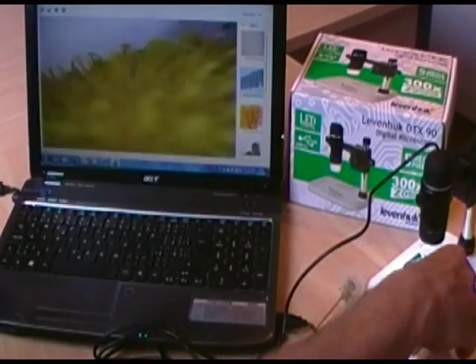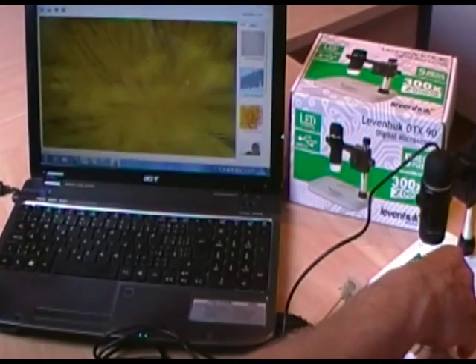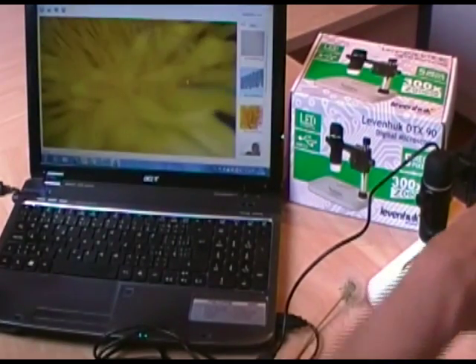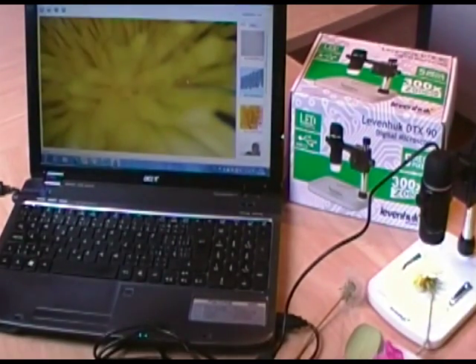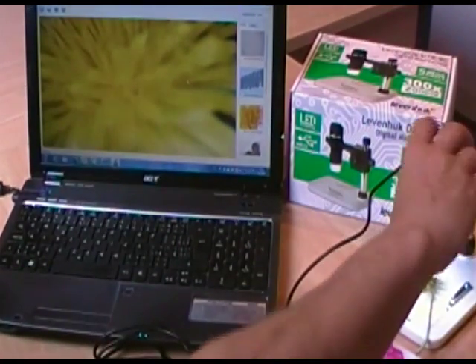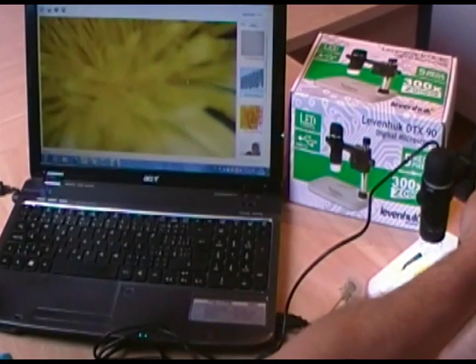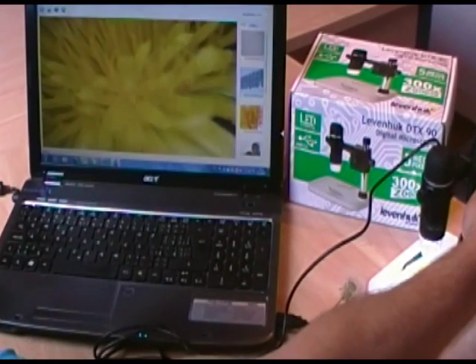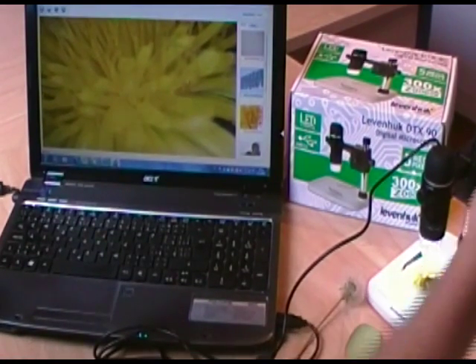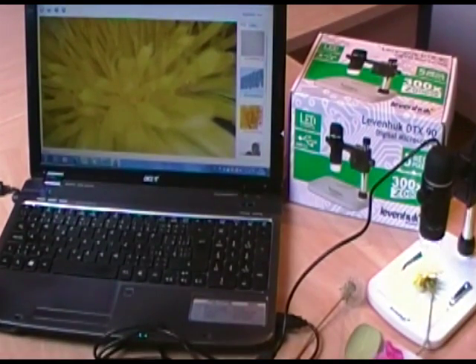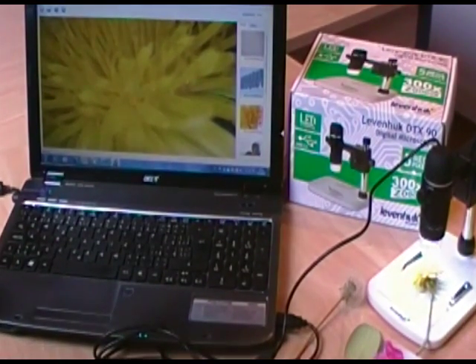It is instantly displayed on the PC monitor and I can easily tune up the observed object to achieve the required size and zoom.